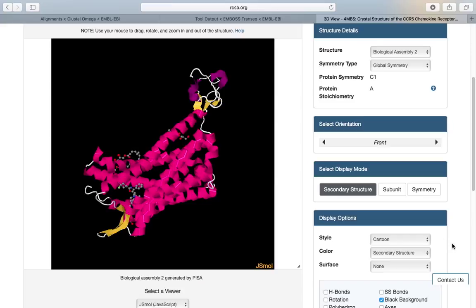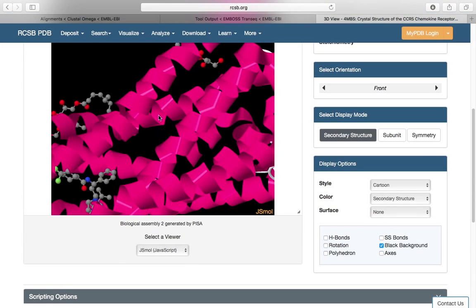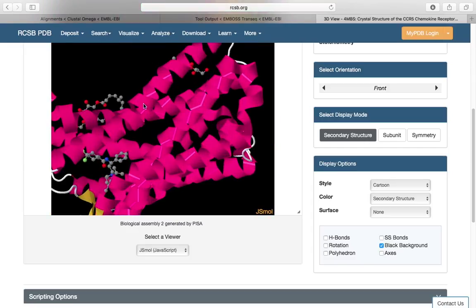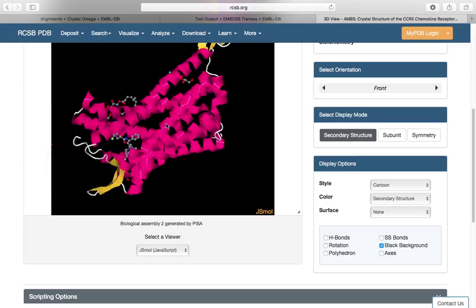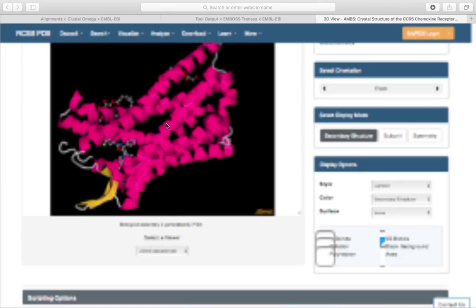And obviously my laptop's being a little bit slower, but I'll leave you to play with that. What we can also do is hover over the protein and see the amino acids involved. So if we have a look here, it'll tell you that that's a leucine right there, and you can stroll across and have a look at the amino acids involved and that kind of thing. Now this isn't the mutant one, this is the healthy one. I couldn't find one of the mutant ones, so we can't really take a look.